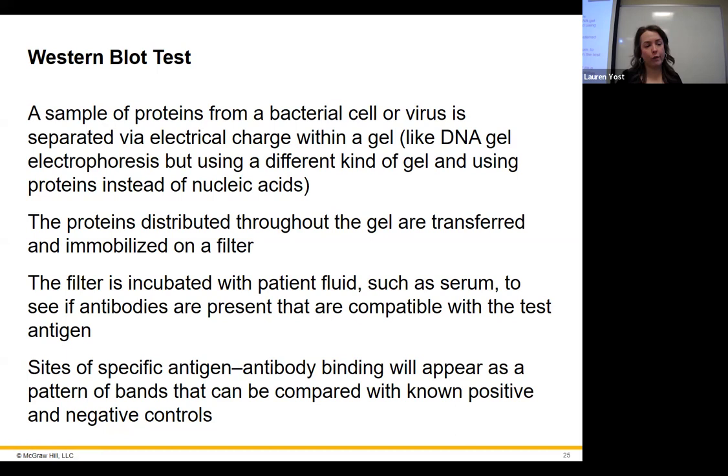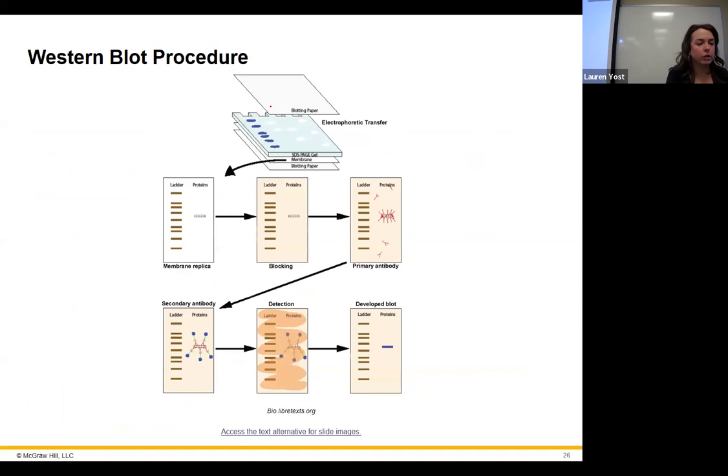So this is a great, I forgot this picture was here, it would have been easier to show you this. You have your gel that you run out. You get your bars that run out just like you would with DNA. And imagine that there was on your gel a bar in about this location on the gel itself, but you can't see it, right?